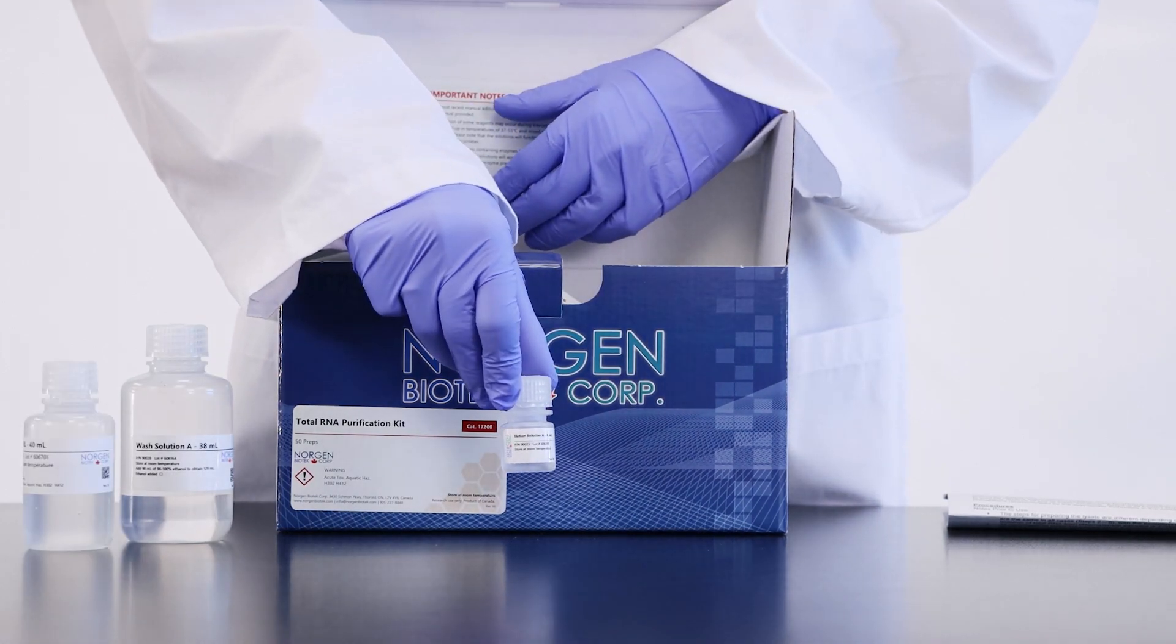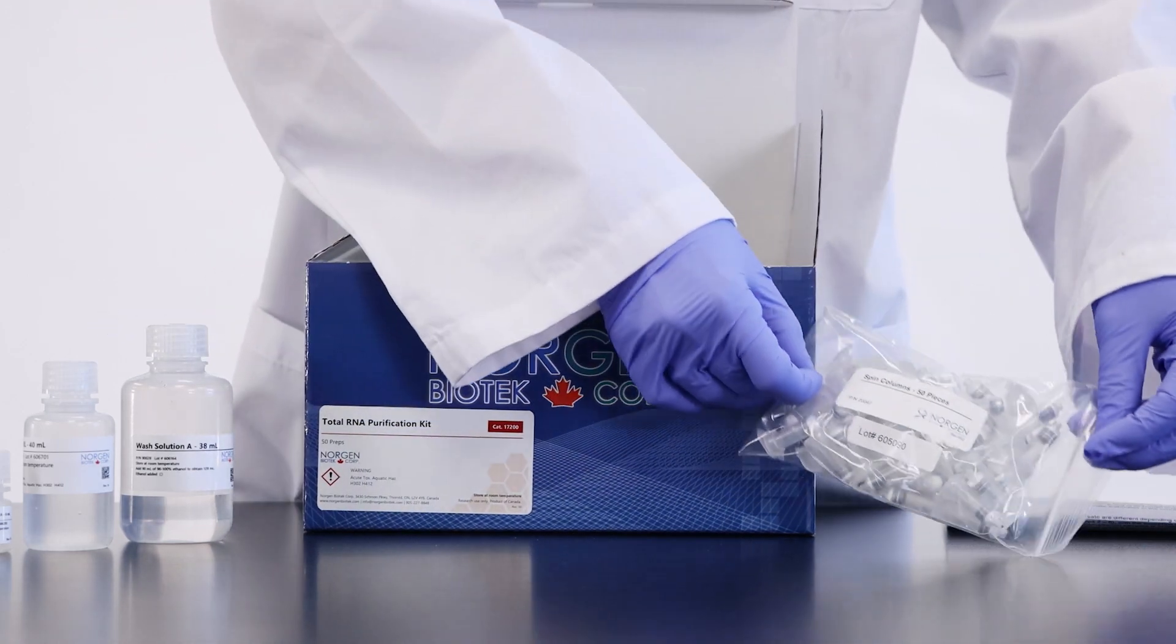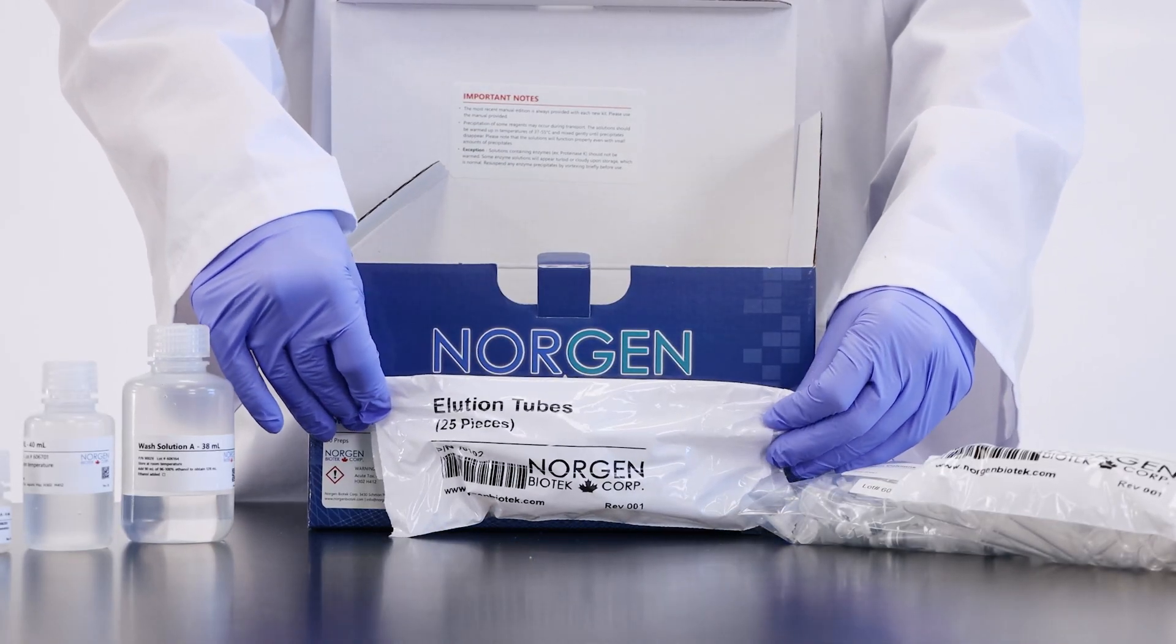Elution solution A, mini spin columns packed with our proprietary RNA purification technology, collection tubes, and 1.7 ml elution tubes.